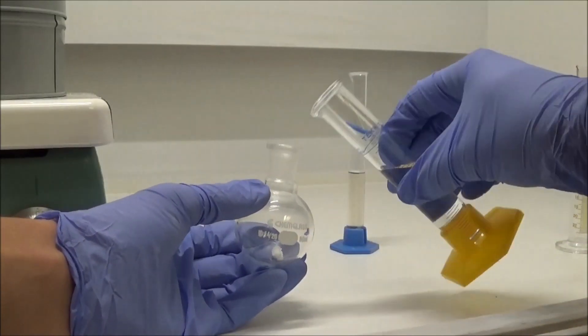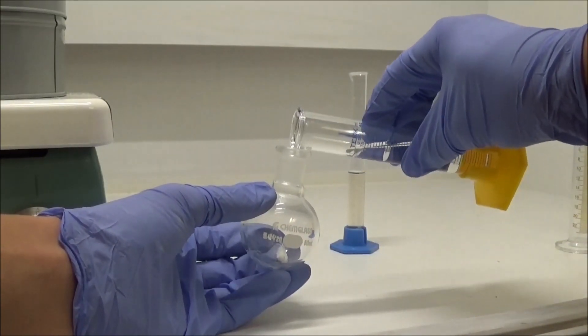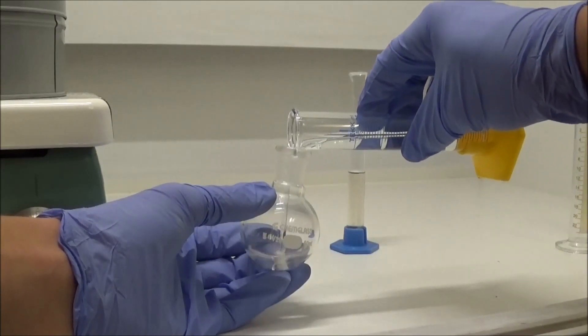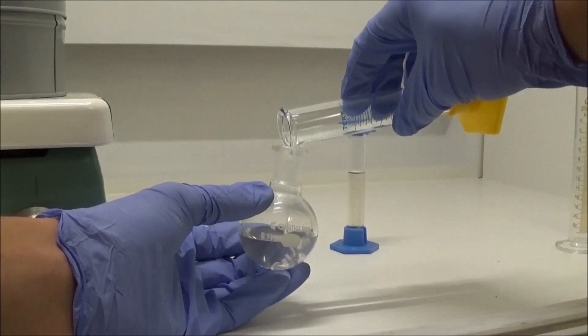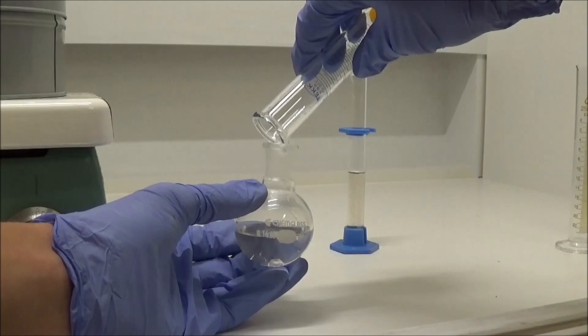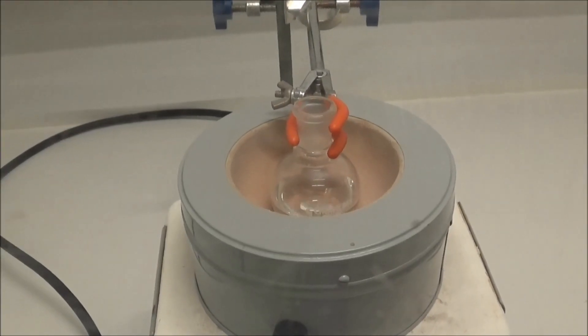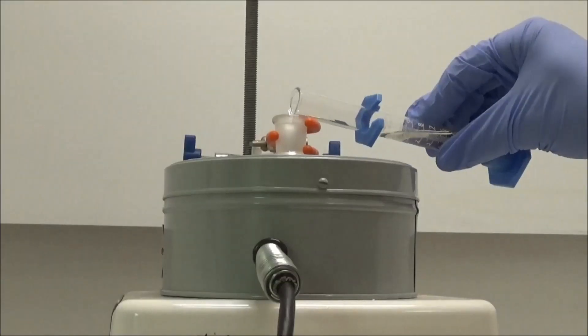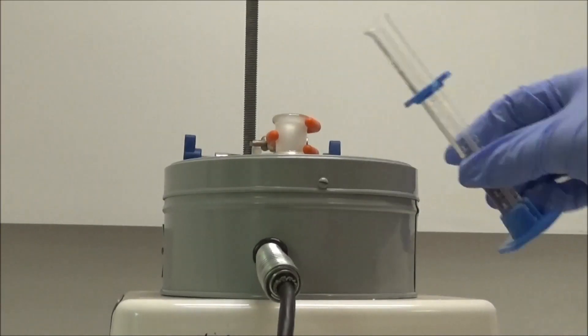I first added the hydrobromic acid to a 50 milliliter round bottom flask. Next, I stirred the mixture while slowly adding 4.1 milliliters of concentrated sulfuric acid.